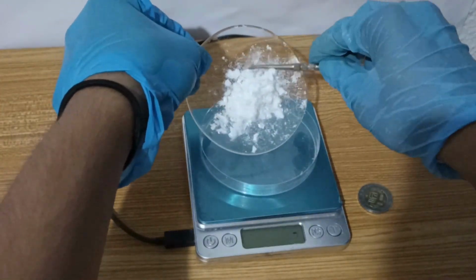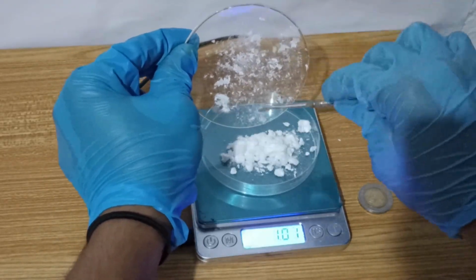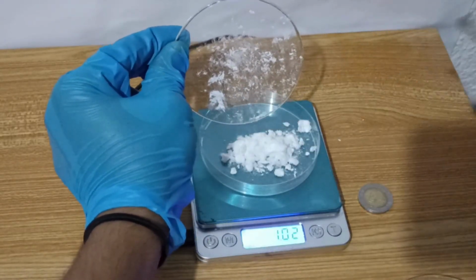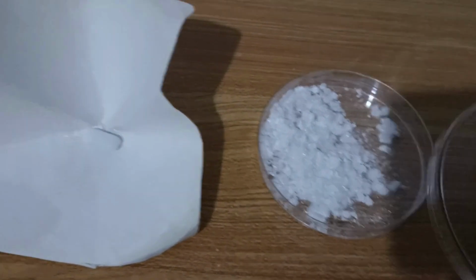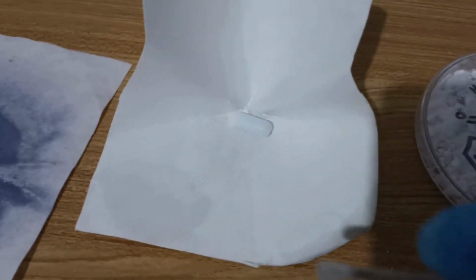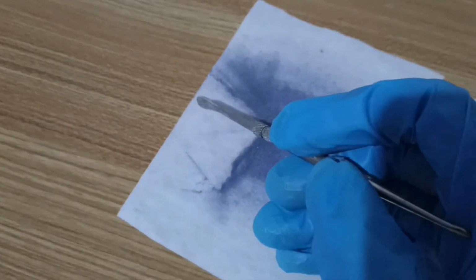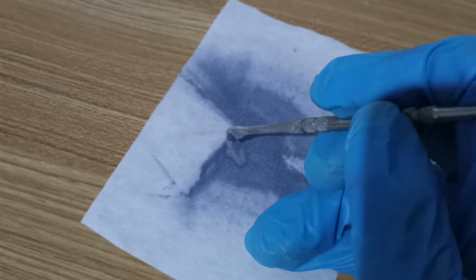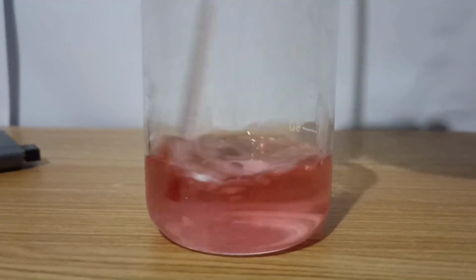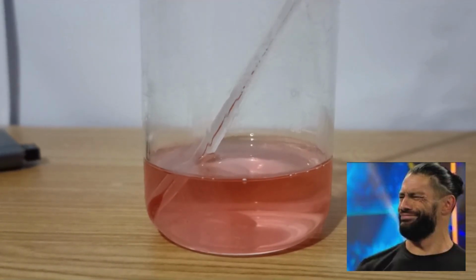I finally weighed my product using my $1 scale. At the end, I got 1.13 grams of phenytoin, which corresponds to a yield of 44%. And I also got these two products, which I mentioned before. I was very curious about the purple byproduct, and I found that it was a pH indicator.